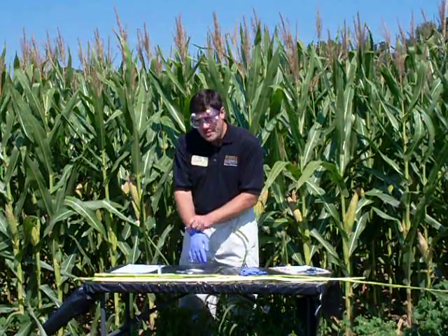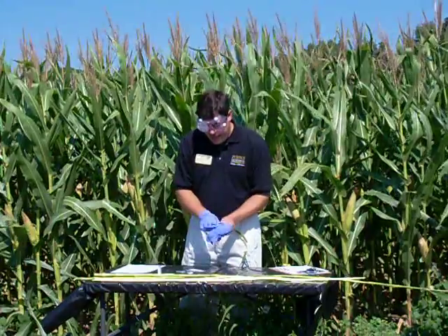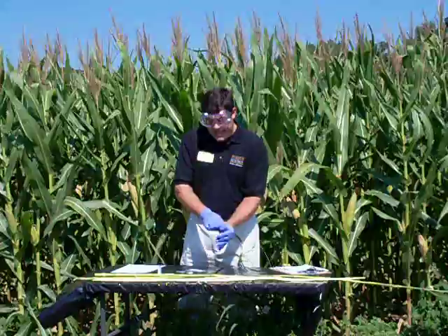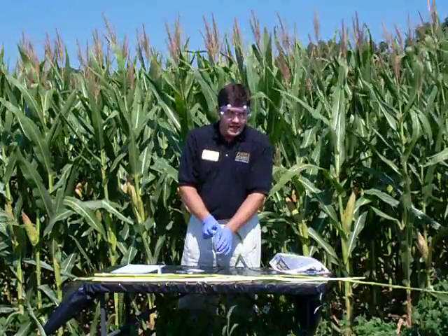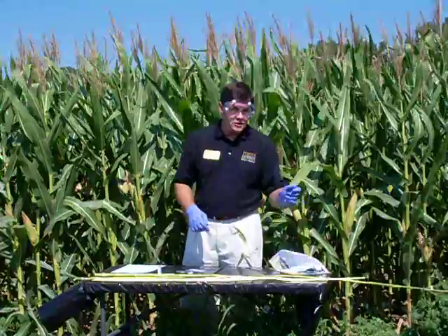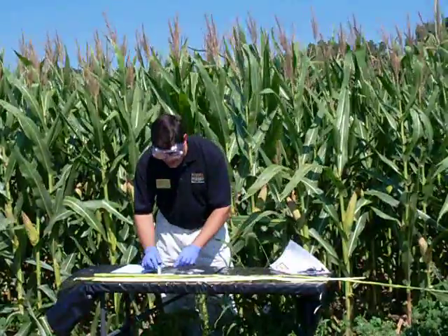Again, just a reminder, this test is not a quantitative test. What we're going to do is locate different color changes within the stalk, if there are any, which indicate nitrogen being present in the stalk. We're not usually concerned as much about it being in the leaves, where it'll be a lot lower than the stalk itself, or especially in the grain or the tassel, where it's very rarely found. Again, it's going to be accumulating, if anywhere, in the stalk itself. So that's what we're looking at mainly for this test.